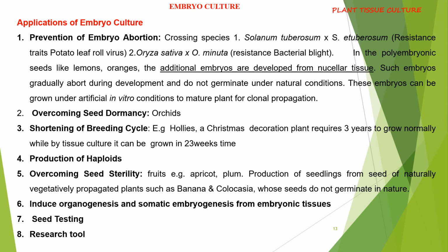Embryo culture is utilized as a viable, reliable, and rapid technique in checking the viability of seeds in seed testing procedures. Embryo culture is also utilized in basic research for studying various growth and developmental stages in an embryo and factors that affect growth.